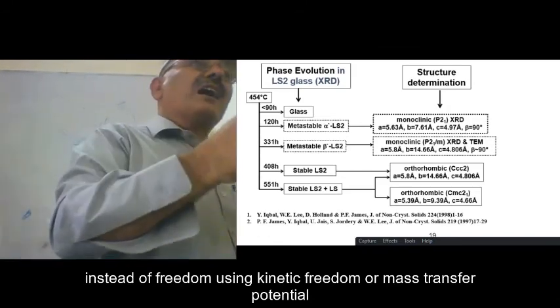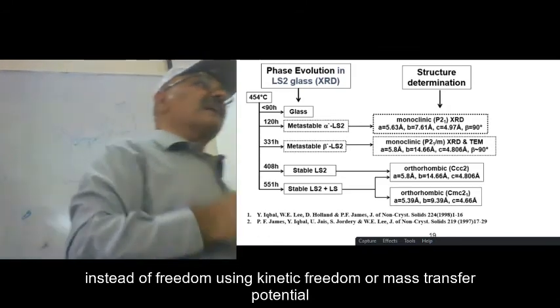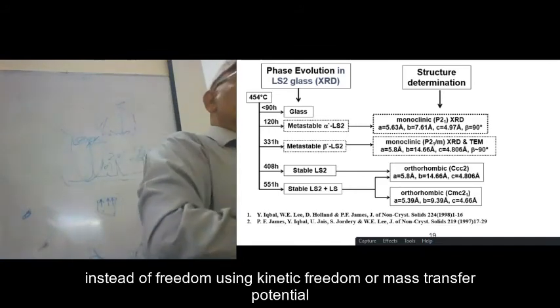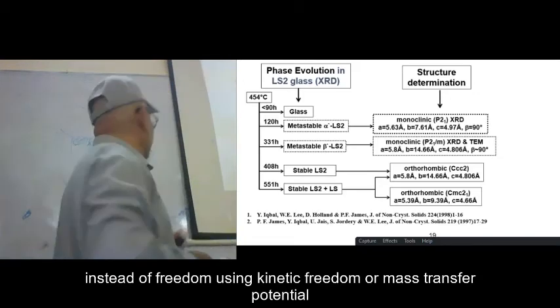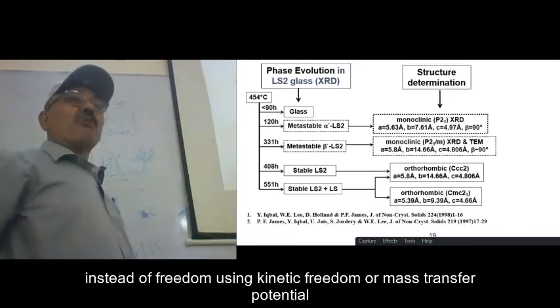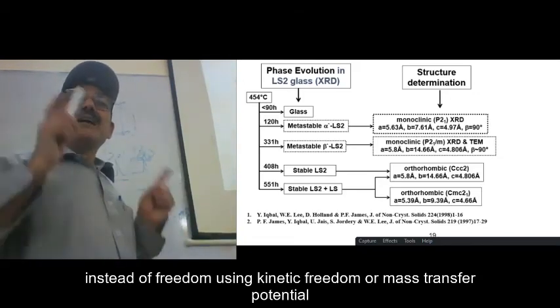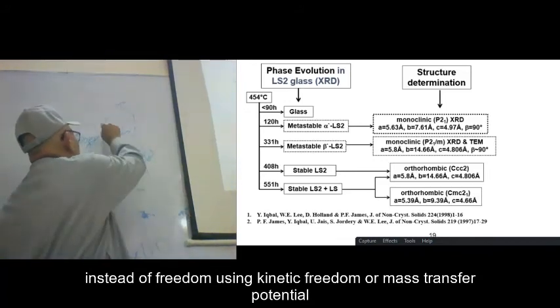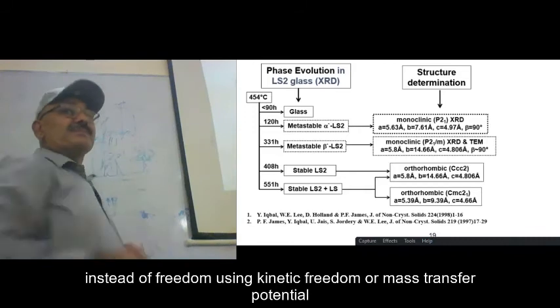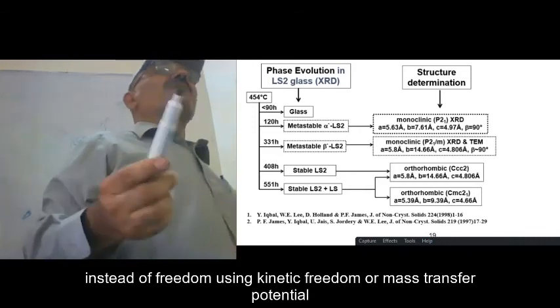This is wrong, because when you compare the data with the theory, the theory gives you, for example, not 001 as the maximum intensity peak, but 111 as the maximum intensity peak.